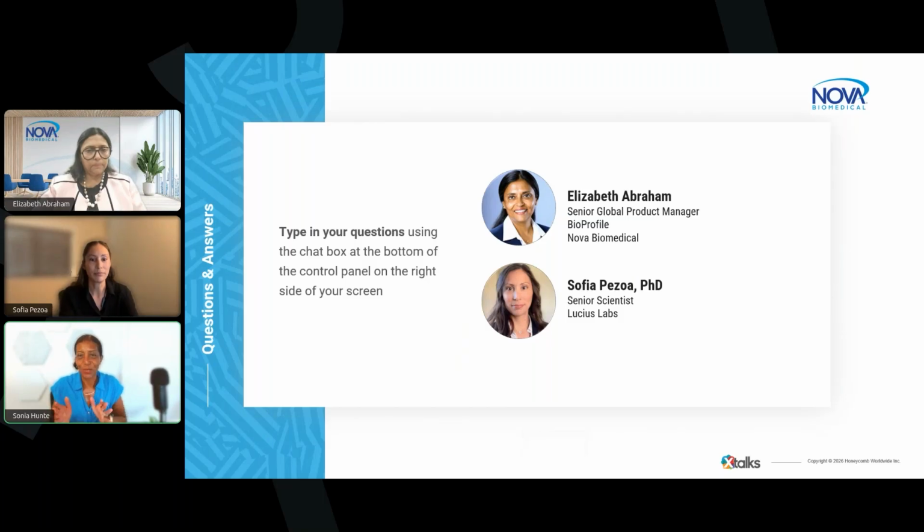Perfect, thank you. Don't go anywhere. I think this next question is for you too. This audience member is asking, the FAST CDV offers inline dilution capabilities. How does that feature help researchers accurately measure cultures that span a wide range of cell densities during the media optimization workflows?